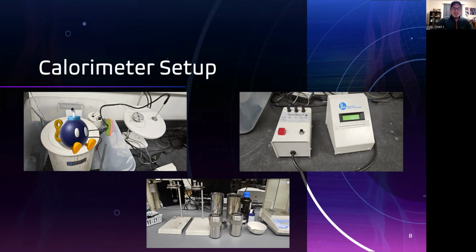The calorimeter was then sealed with the basket and the lid. This needed to be sealed very gently to avoid any kind of issues. In order to get our controlled conditions, the bomb then needs to be pressurized. So the bomb is pressurized and depressurized multiple times with pure oxygen until it is primed and ready to go. In order to help control the explosion, DI water was poured into a bucket that would hold the primed bomb.